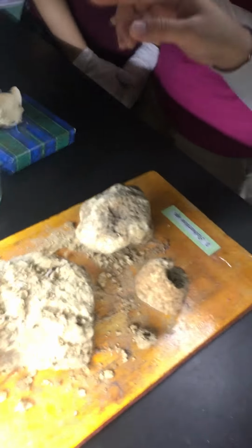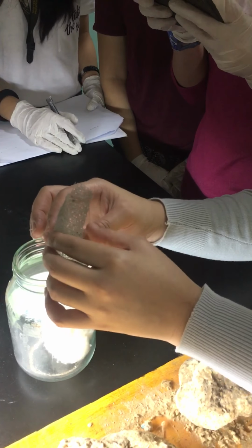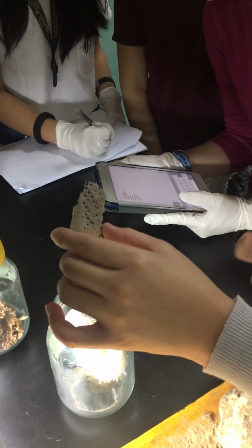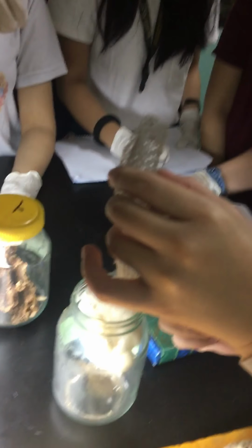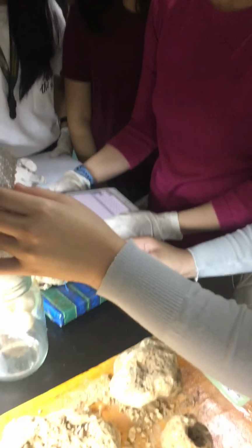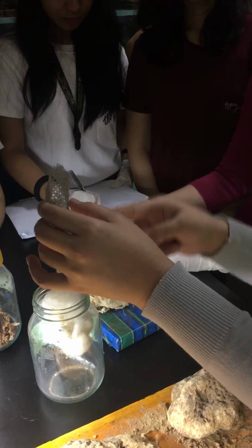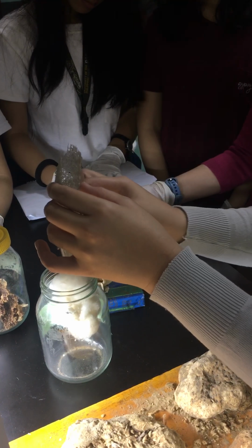This one got damaged. I had a collection of this. I should have had three, but I don't know who broke it. But this is supposed to look like this. So remember, one characteristic of hexactinellids is that they are columnar, vase-like, or urn-like. So it should look like that. And here is its basal tuft. Usually, they say hexactinellids have mutual shrimps. The shrimps clean the surroundings inside. In return, the sponge gives a home for the shrimps. Okay, so that is how it looks.